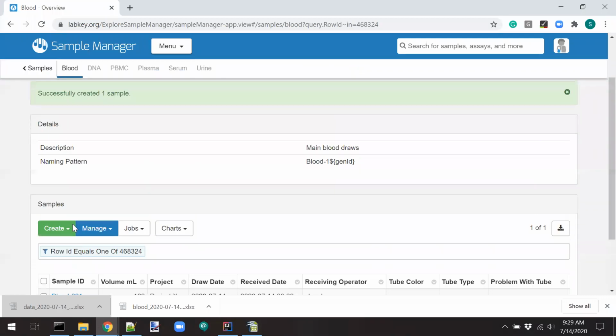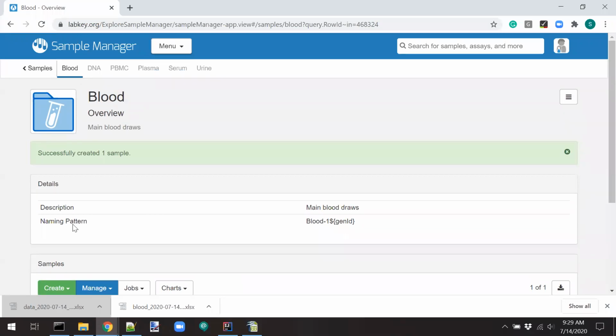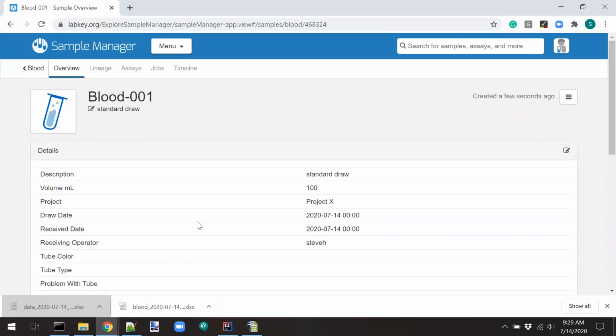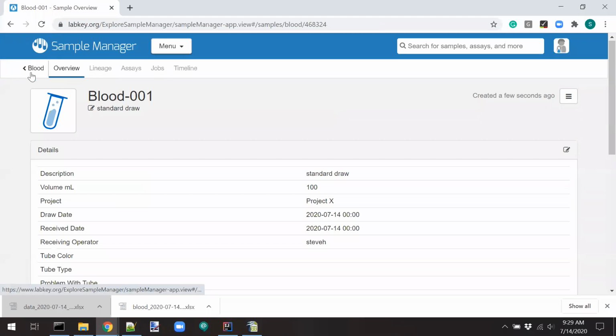But any questions before I keep going into the next steps here? Just at this point, Steve, you use the Excel template, but do you have the ability, either from the Excel template or from the user interface itself, to add additional fields to capture other variables related to the sample? Absolutely. So if I found my current sample grid or my sample type insufficient, I can absolutely go and edit it.